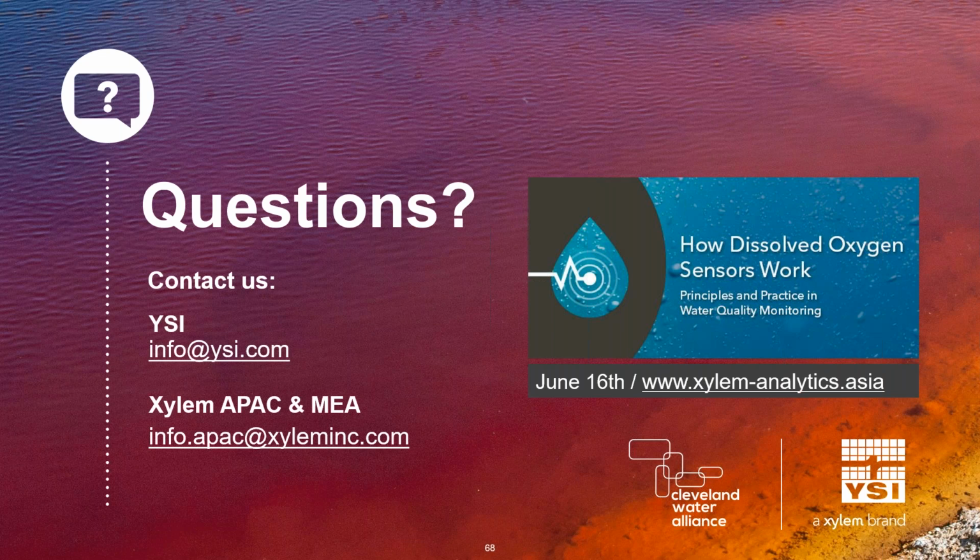Now, hydrogen ions are so small, they basically have a unique charge to size ratio because they're small and they have a very specific charge. So nothing else really looks like pH. So pH you can use in that salt water and it's not going to be affected by the numerous other ions that are also in the water coming to the party and kind of throwing all our readings off.